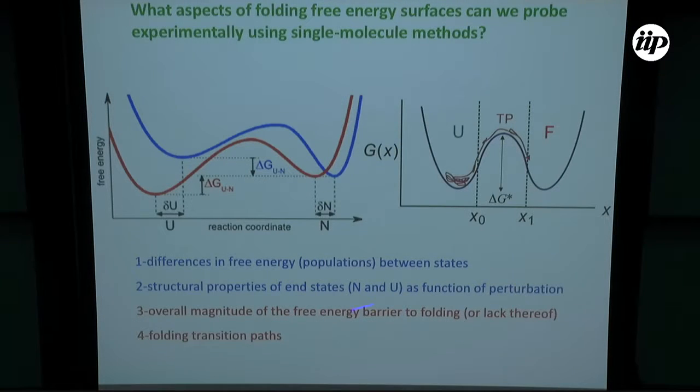This is also interesting because, from what I discussed yesterday and this morning, you know that when analyzing experiments you have to do baseline extrapolations really far away. If you don't know anything about the properties of the state, these baselines could be completely wrong and the numbers could be off. Those are the basic things, and I will show some examples of those two in a moment.